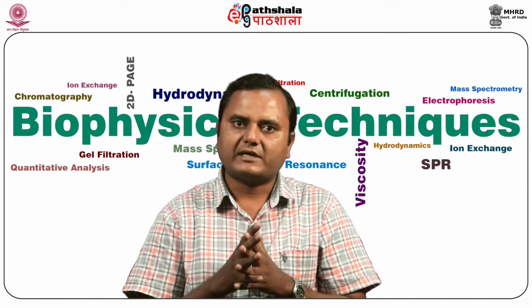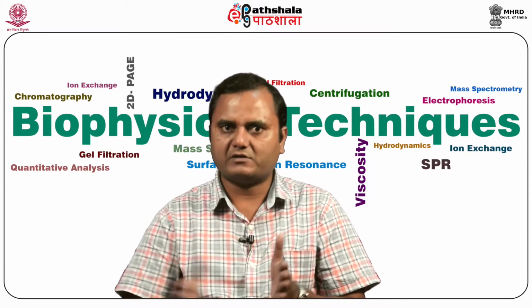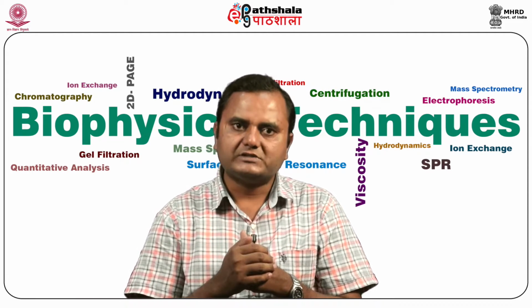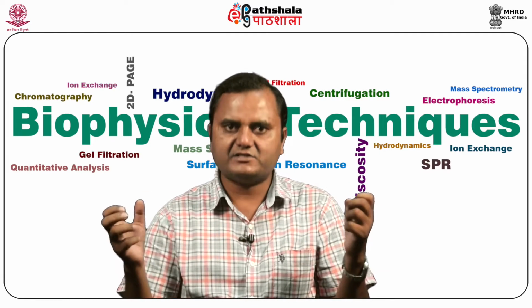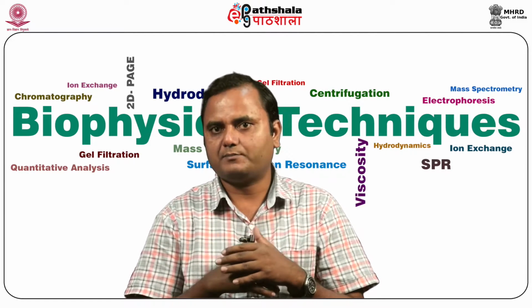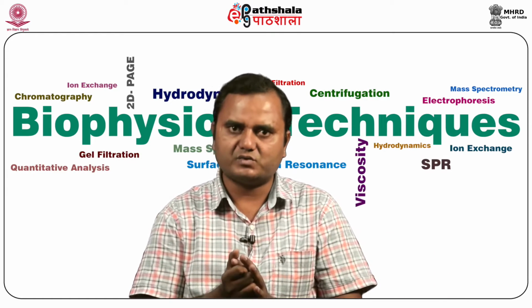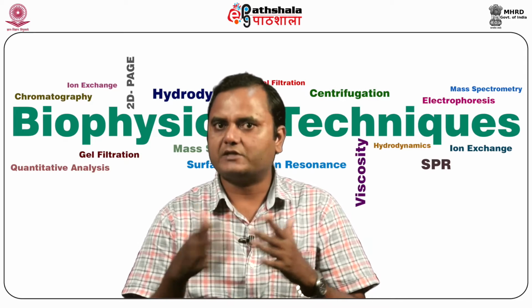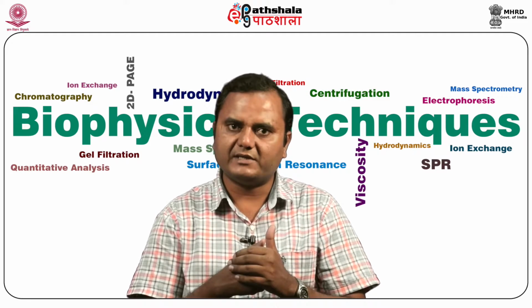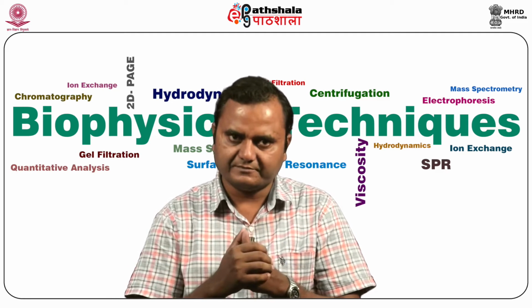It can be used for the calculation of molecular mass, and it is applicable for a large molecular mass range from 100 to 10,000 kilodalton. So it has a very wide range for the calculation of the molecular mass, and it also gives you the properties of the molecular mass in the solution form. Usually the other techniques used for the calculation of molecular mass are not in the native form, like SDS or mass spectrometry. There are harsh conditions, but here the condition is as good as the native condition.